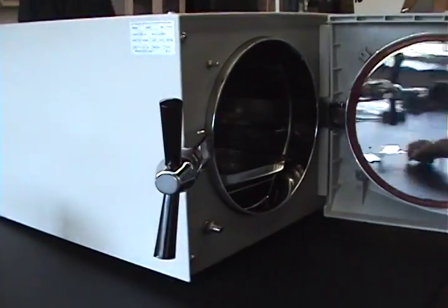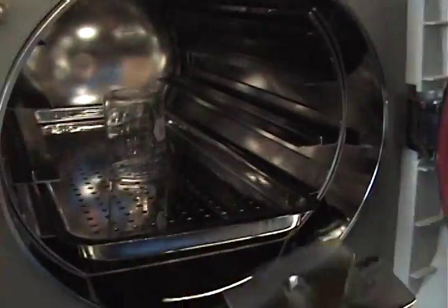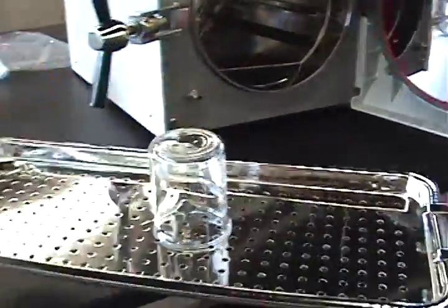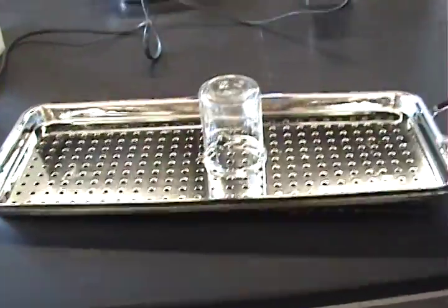Take the clamp and open your autoclave. This is what your autoclave should look like — dry. Now carefully remove the tray; it should be very hot.